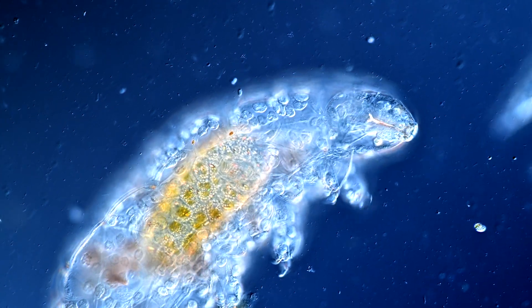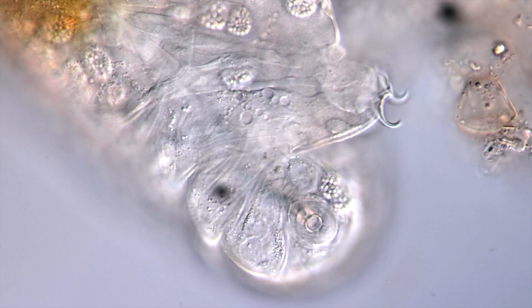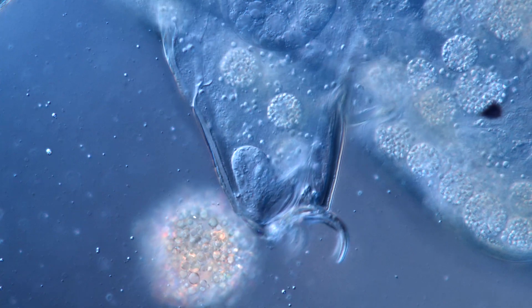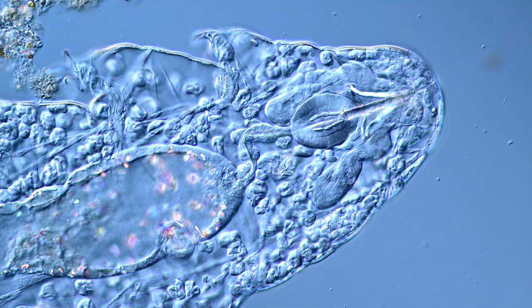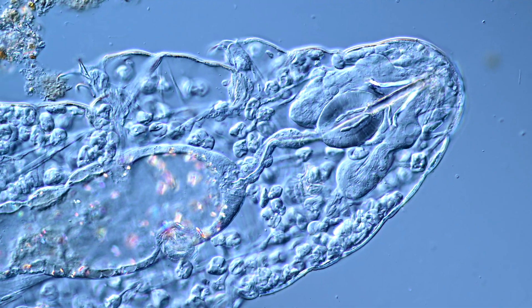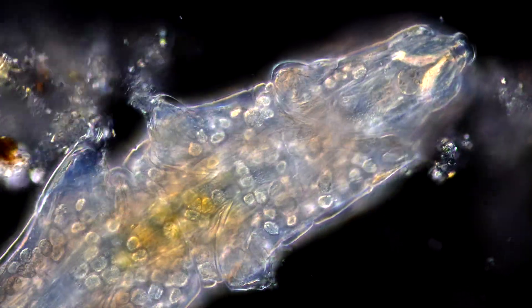Tardigrades, also known as moss piglets or water bears, are quite popular these days. If you have ever wondered what a tardigrade is made of and what is inside of it, you have come to the right place. In this video, I would love to show you the inner workings of a living tardigrade. Let's dive right into it.